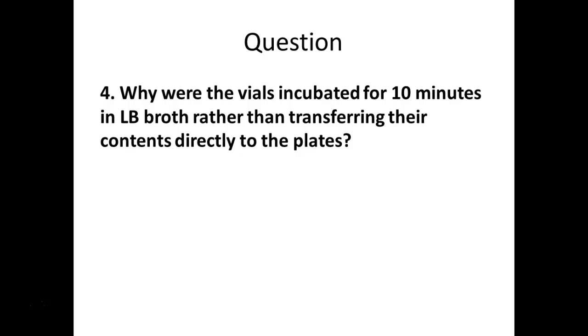Well, they've taken in the DNA, but what do they need to do with that DNA? They need to use that DNA to make what? The enzymes, right? So it's got to go DNA, messenger RNA, protein, right? It actually has to make the enzyme. Because if it doesn't make the beta-lactamase enzyme, what's going to happen? It's going to die when you put it on those plates, right?